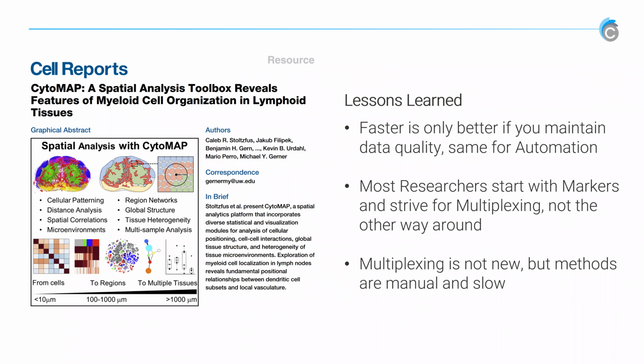This was actually to make sure that the instrument I was selling could be used with CytoMap. CytoMap has been around for quite a while, even before 2018. So the point being that calling something spatial biology, certainly the term is new, and certainly there's been an explosion in the number of solutions available, but the actual work and the actual application is fairly old. And there are people who have already formed opinions on what you should be doing here.